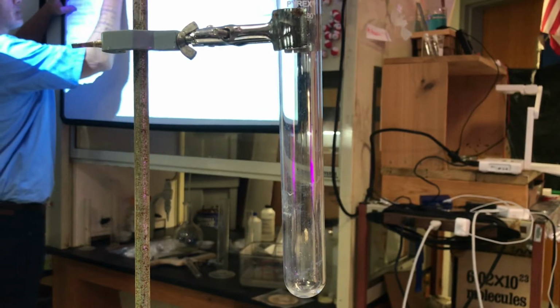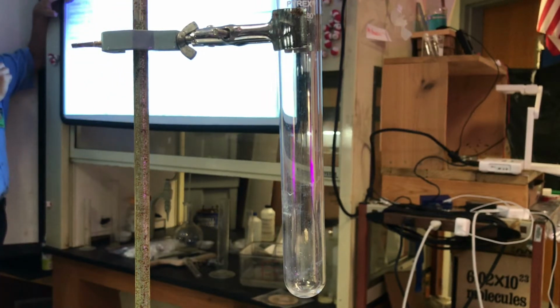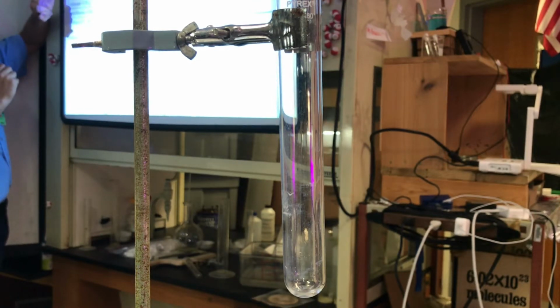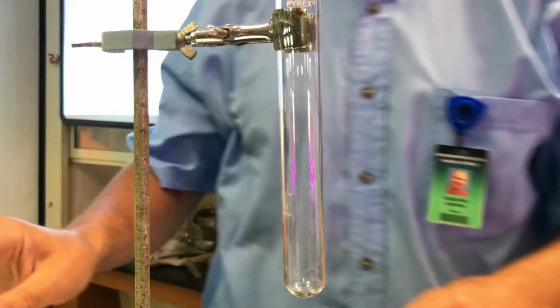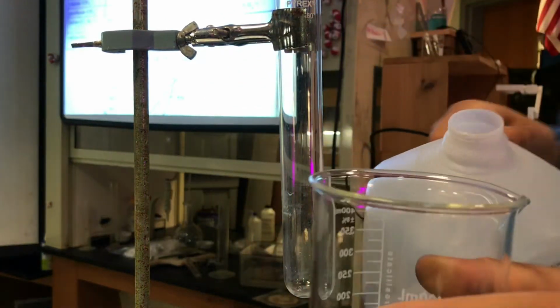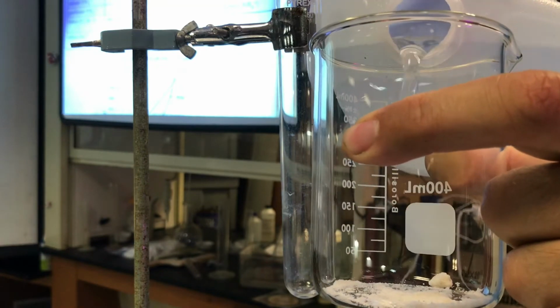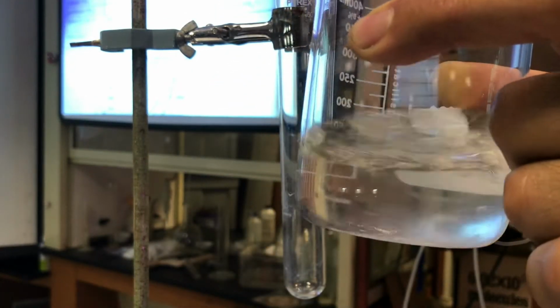So if I have lead nitrate, notice the 2, because lead is +2, each nitrate is -1. You get that from table F or table E. All right, so obviously I've got lead nitrate. Taking lead nitrate and some water, there's the salt, a little bit of water, and I stir to my heart's content.